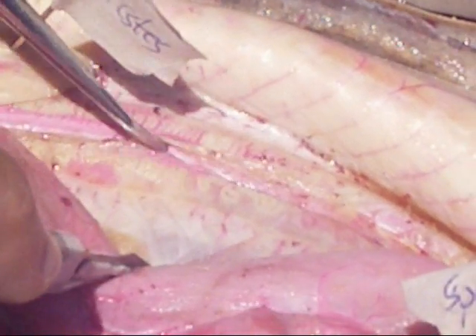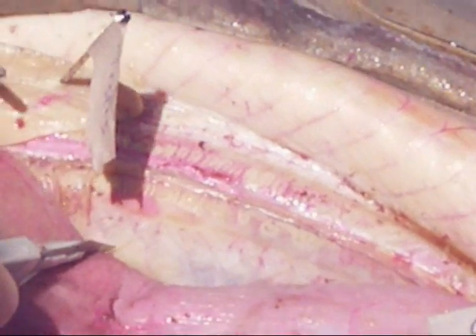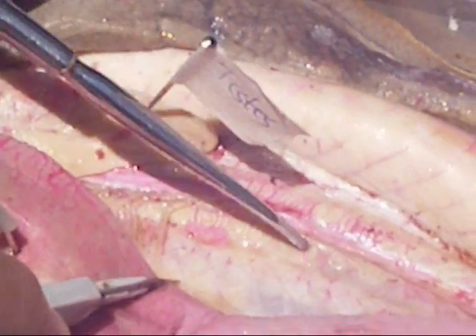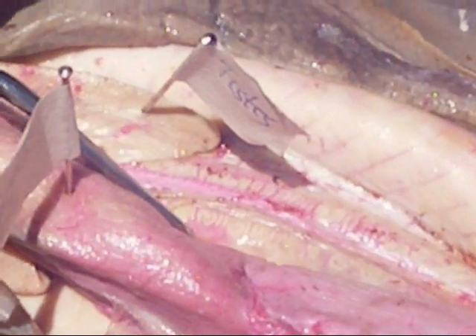Do they have to know the reproductive parts? No. Well, you know the testes, right? The kidneys are little tubes in the back muscle. That's your little muscle — back muscle.